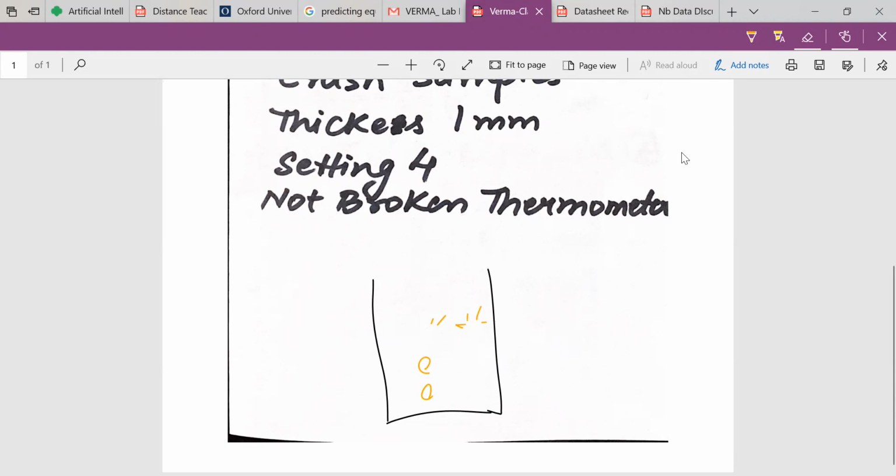When we have a boiling stone, this is what it would do. A boiling stone would create a nucleation site for the air molecules. Remember, air is present in all of our liquids, and hence this will help it organize in a more orderly fashion.